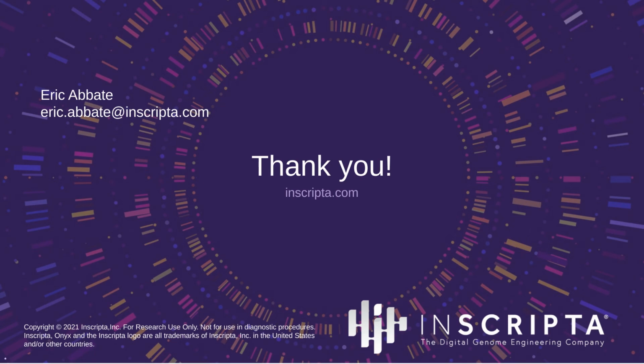Thank you. Next question. How flexible or robust is the Designer software when it comes to non-canonical, non-model microbial species? What are the inputs and outputs of the software? Yeah, so currently the platform is optimized for and really supports only E. coli and S. cerevisiae. The software, the design scores, and the guide RNA designs have all been optimized for use in E. coli and S. cerevisiae, a couple of different strains of each of those. So it doesn't really support the use of other microbes at this time.